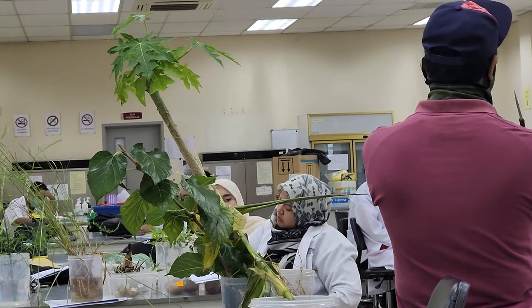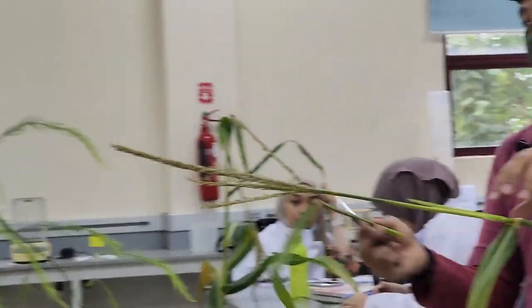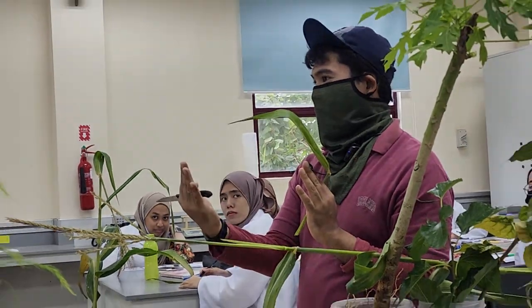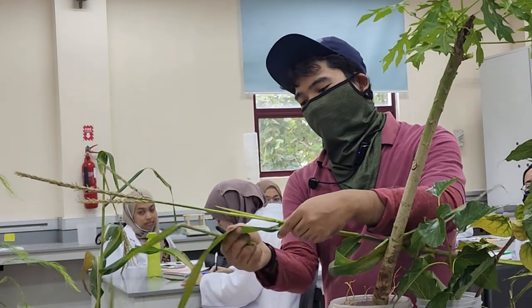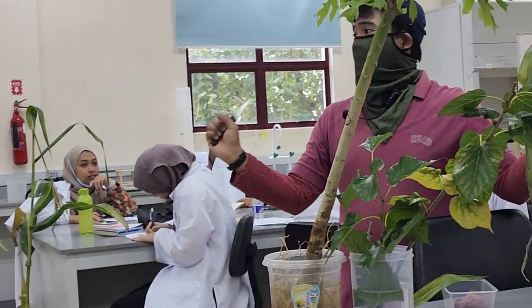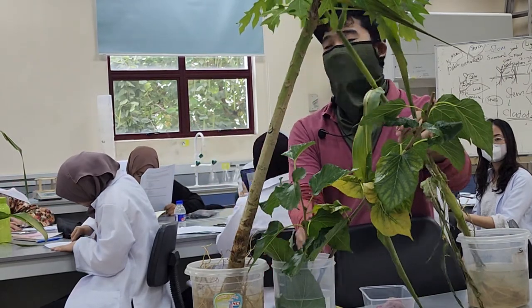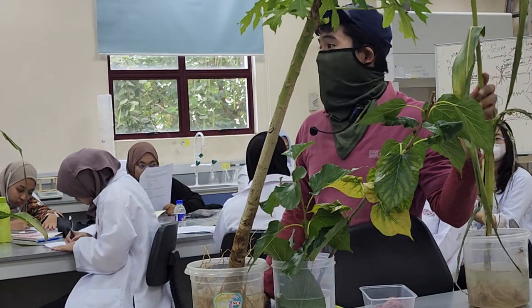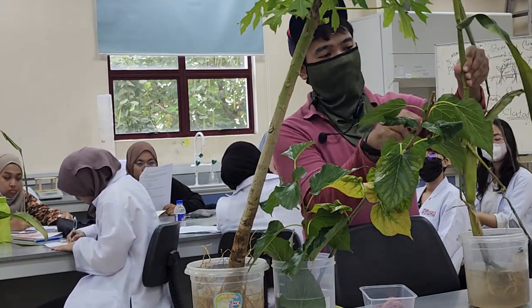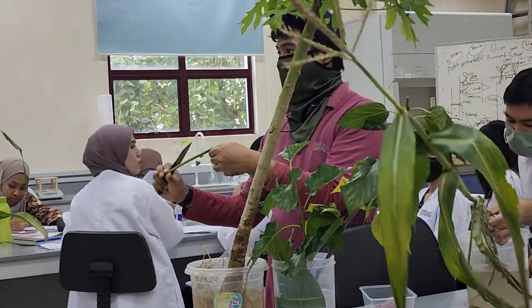Now comes the interesting part. Look at this sheath. It's in the form of semicircle, right? So these sheaths can wrap upon each other and encapsulate one layer upon another. So this leaf here gets wrapped under the previous leaf and so on. When many layers of leaf sheaths are compressed tightly wrapped together, they form the illusion of stem. That is why we don't call it stem, because the hard part that you have here is actually the concentric circle of leaf sheath, this part here.